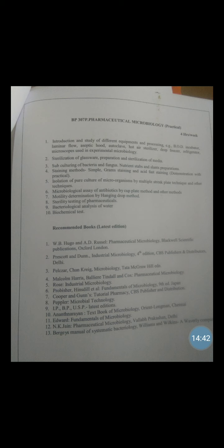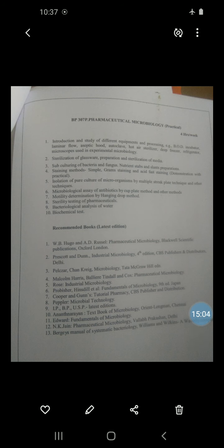Wash the slide carefully with 95% alcohol — the decolorizing agent — until the washing solution becomes colorless. Then wash the slide again with water and add a few drops of counter stain — safranin — and allow it to react for a few seconds. Wash the slide again and dry it by natural drying only — no artificial drying. Add one drop of cedar oil and observe under oil immersion objective, that is 100x objective.